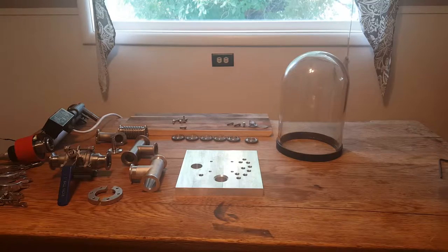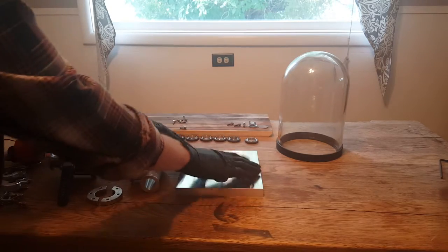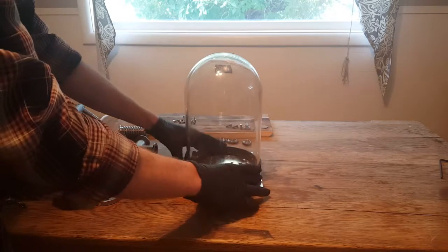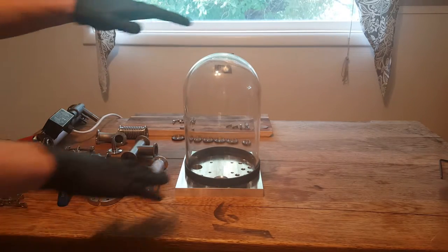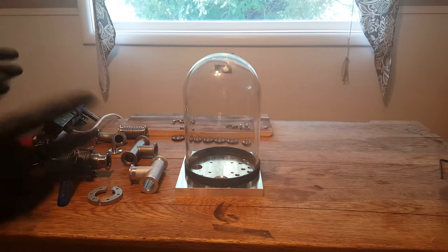This is a basic layout of the high vacuum parts — not all the parts, just some of them. The actual electron microscope will be contained inside this base plate and this bell jar, which seals everything up. The bell jar is fairly small — much smaller than a standard vacuum chamber and gun — and I know that and I'll have to account for it. This electron microscope will never be the same quality as the million-dollar ones research companies buy, but the goal is just to explore the science behind them.